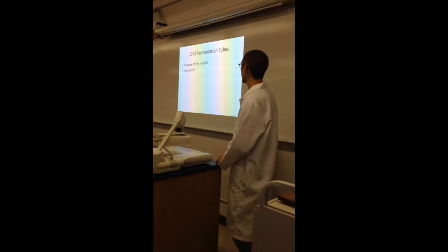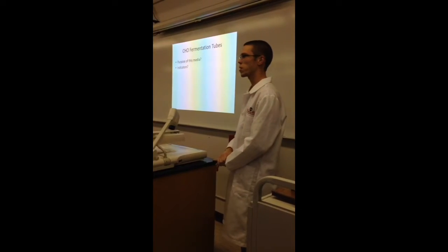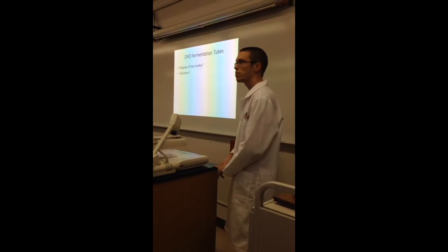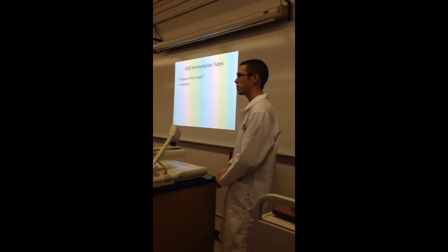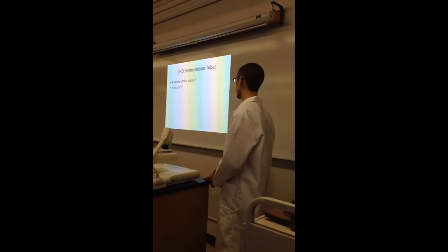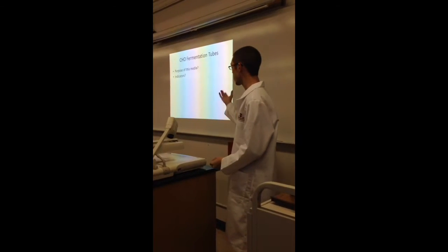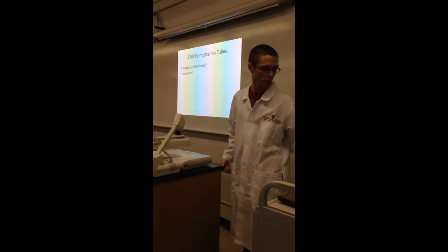Another one that we're looking at is the carbohydrate fermentation tubes. So what's the purpose of this media? What do we use it for? Test for carbohydrate fermentation. Right, so for each carbohydrate that you're looking at, it just tests whether or not the organism can utilize it.